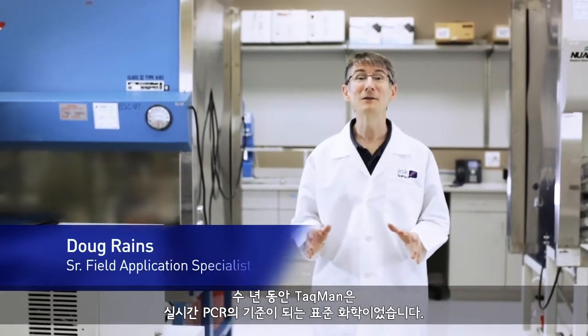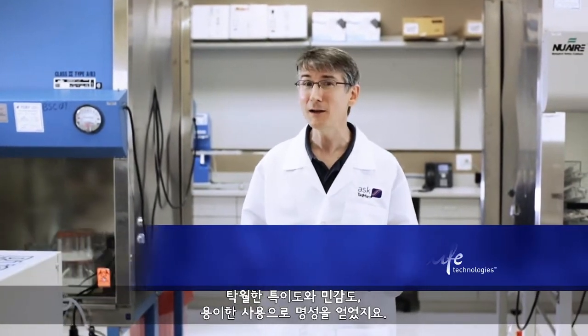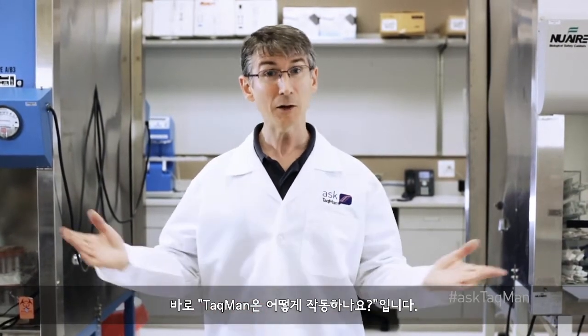For many years, TaqMan has been the gold standard chemistry for real-time PCR. It's famed for its unparalleled specificity, sensitivity, and ease of use. So it's not surprising that users want to know what Shrikant at ICL College in India asked recently — namely, how does TaqMan work?